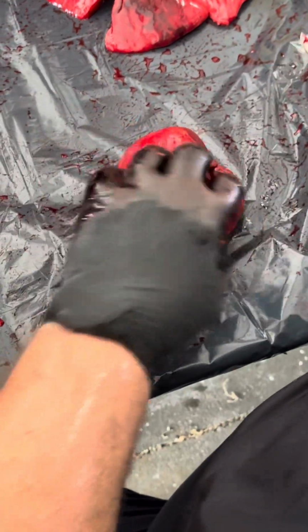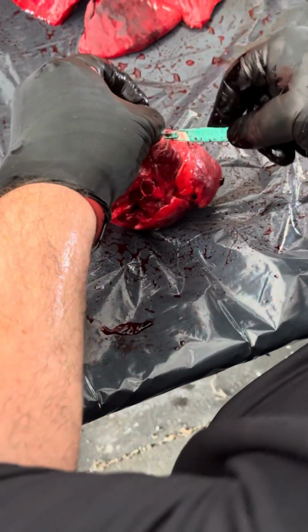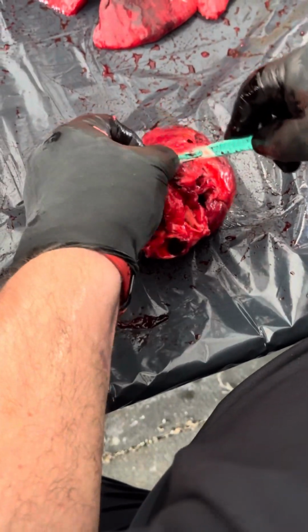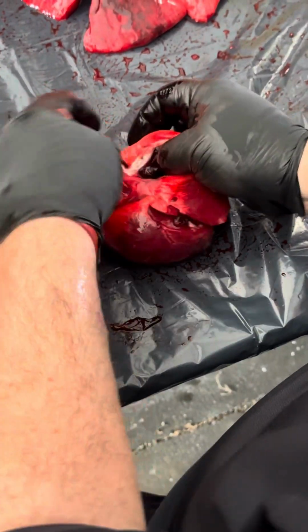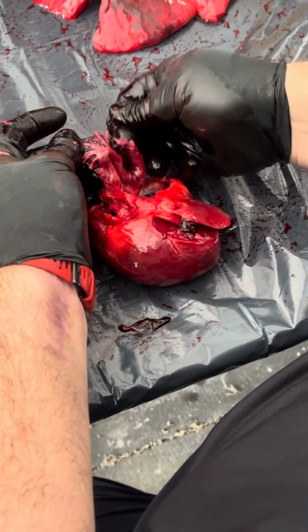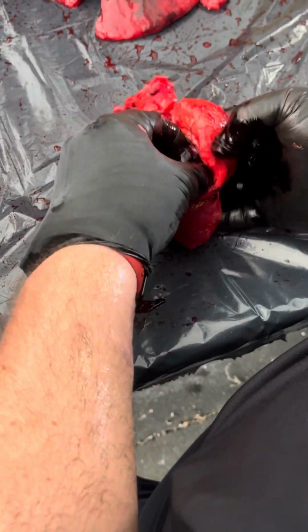And if we look at it from the top, by taking the atria off, it's full of clot. It's all papillary muscle. Look at that monster. Holy crap.